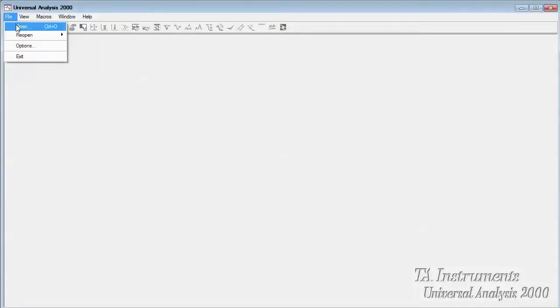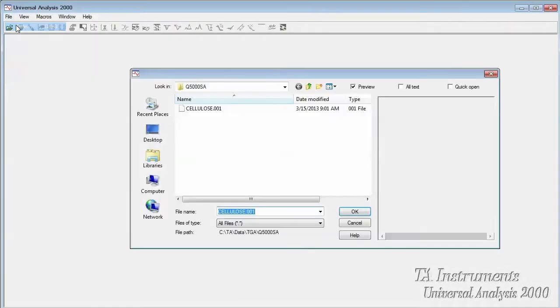To begin, let's open the data file in UA by selecting File Open, browse into the location of your data file, and then select OK.